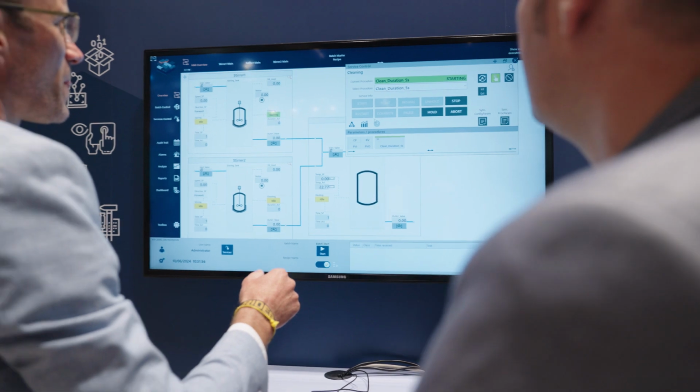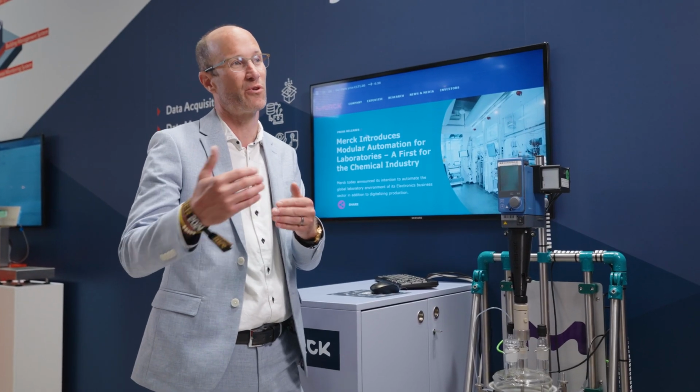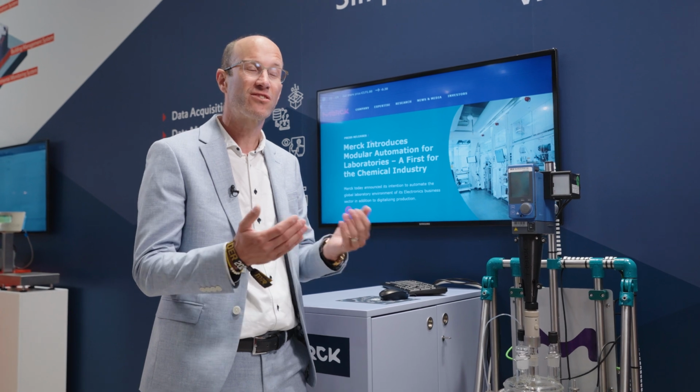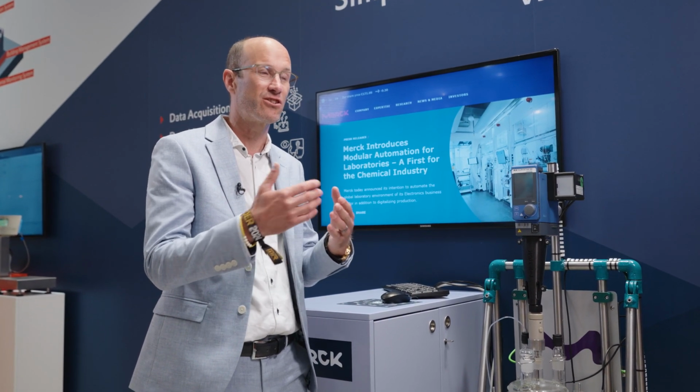And this searchability directly leads you to the use of AI, of large language models and everything else. This is really the future where we are now heading. And the interesting thing is it's already there, because there are different initiatives in Germany which are focusing on this standardization of naming, for example, in the research environment.